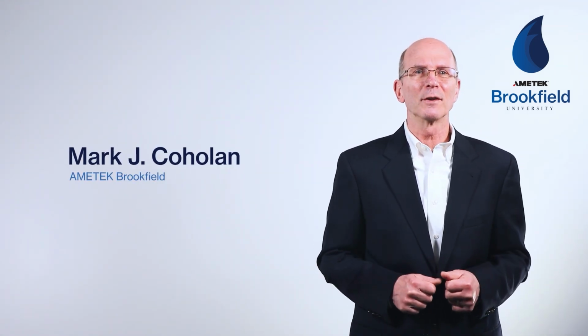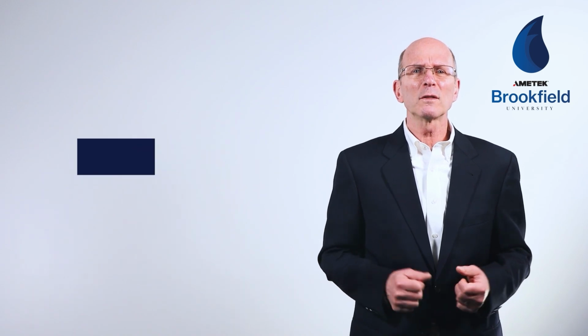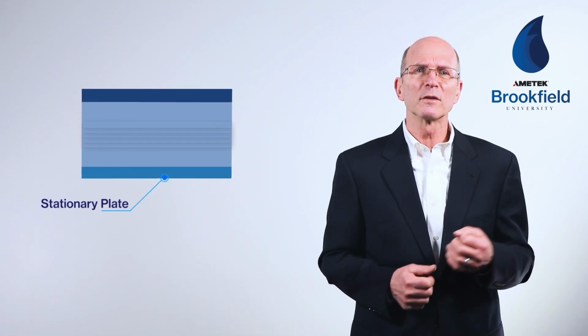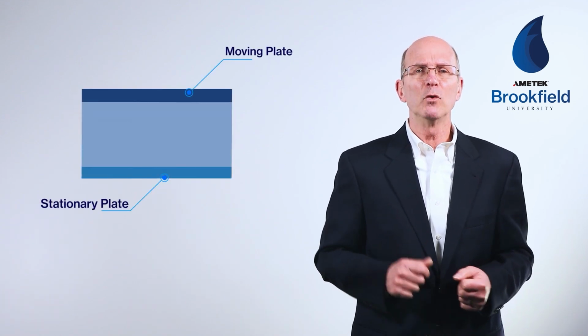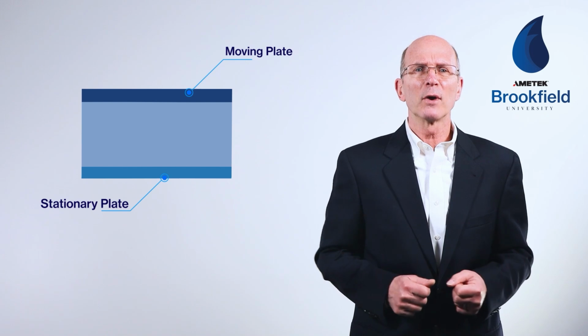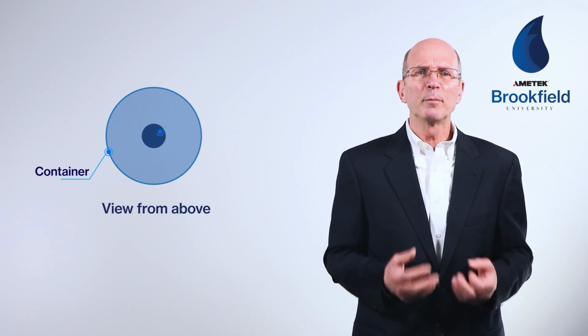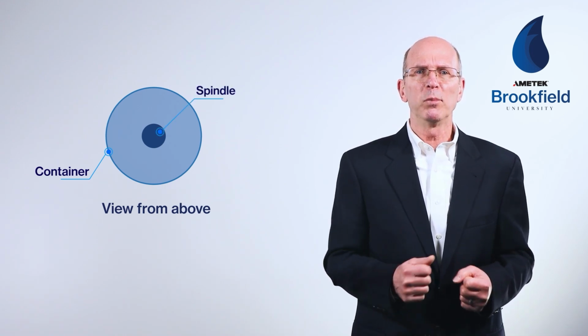So let's get started. Let's look at this fluid model. On the left, picture this as a stack of cards. There is a distance between the stationary plate and the top moving plate. This diagram represents the sample material in a container, where the container wall is the stationary plate and the spindle surface is the top movable plate.